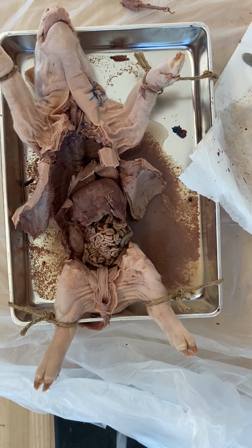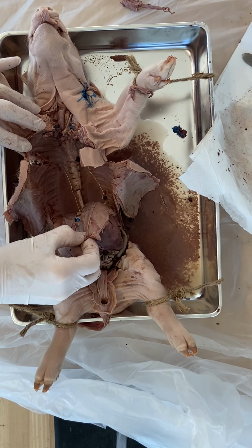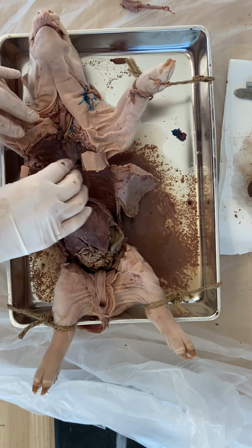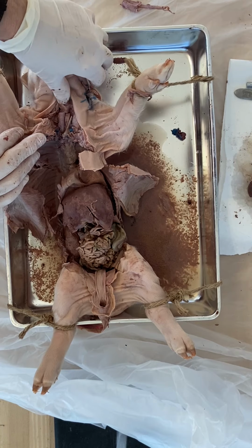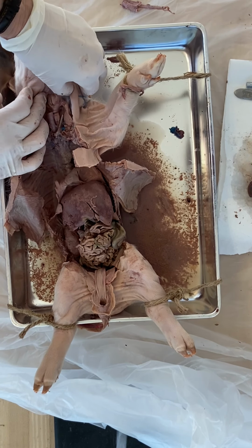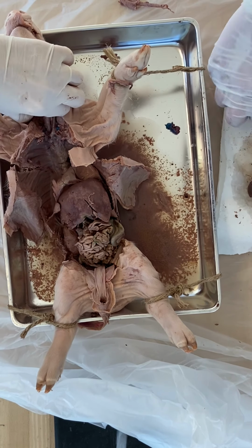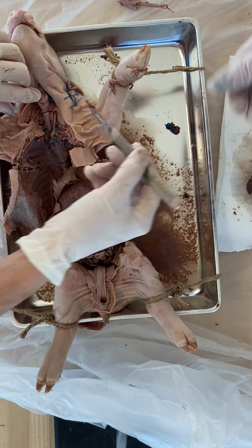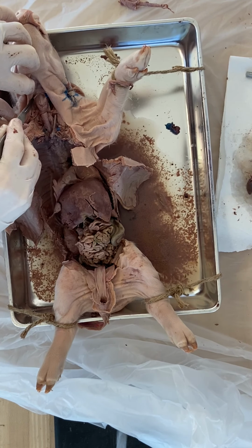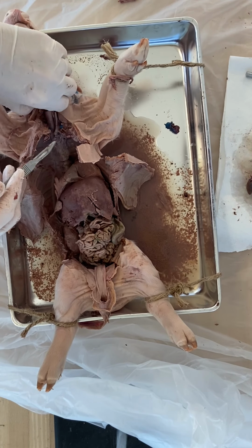Wonderful. Okay, Mrs. Martin, anything else you think we should point out while we're here? I really feel like that has pretty much covered it. You might be able to get the larynx out. You want a knife? Yeah. Make sure I got the right thing. I know, that's tricky, that blade. More than once I've tried to cut with the wrong side.